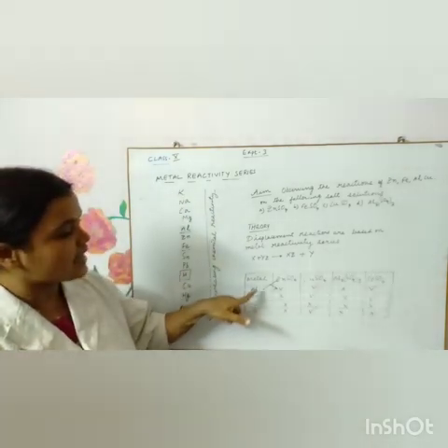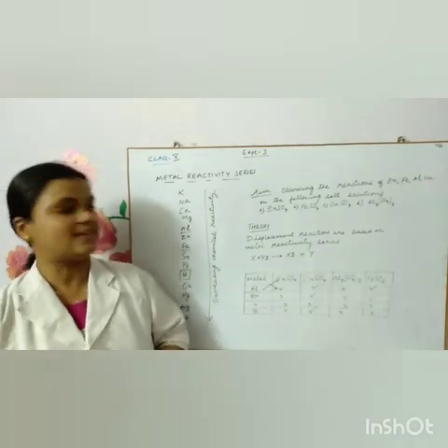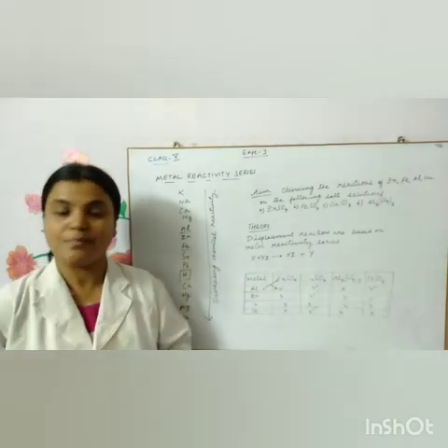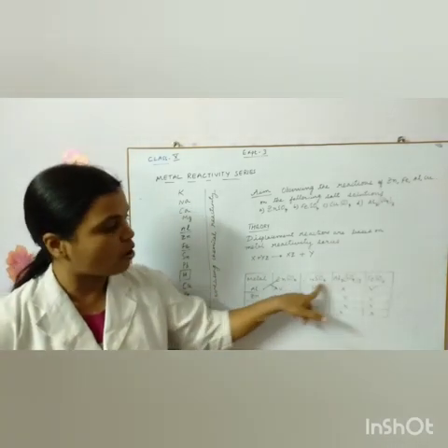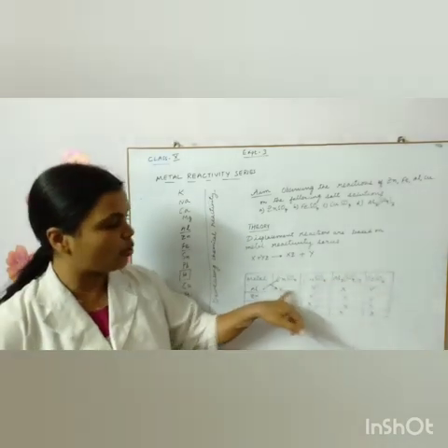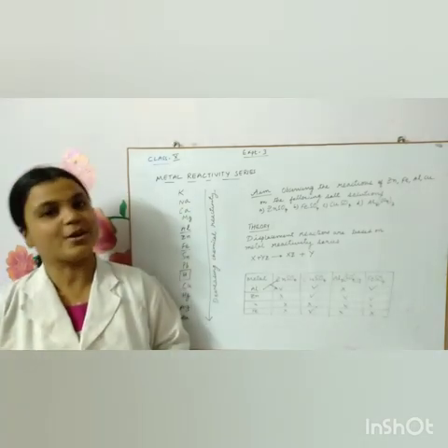Okay. So we'll start with aluminium, children. Please do watch this. Let's go to the lab and do this experiment, where we'll be making aluminium react with all these salt solutions, and we'll note down in this observation whether it is correct or not. We will check. Okay. Let's see.